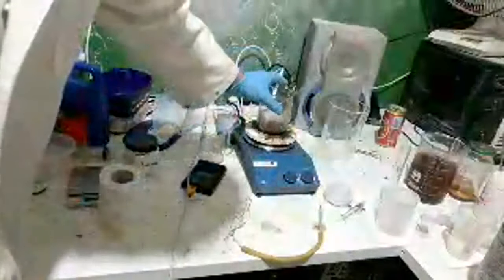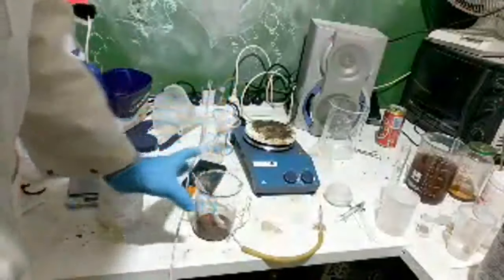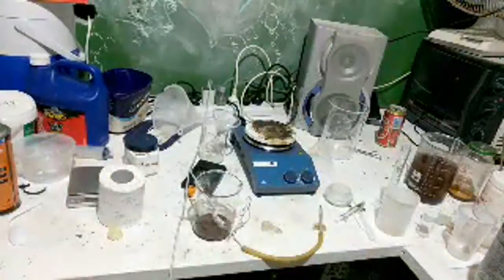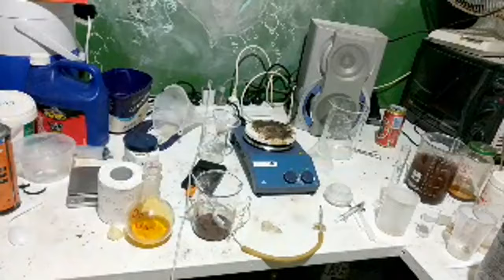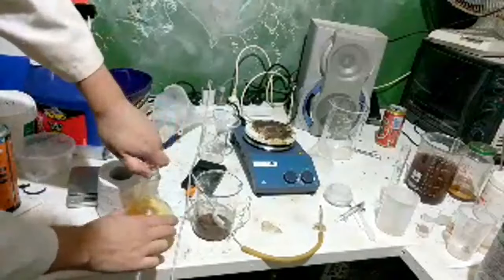Should it be dissolving better than that? I'll give it a bit of heat. Don't crack it, it'll crack the glass. Should dissolve, right? It should be good, concentrated nitric. Bring out the big guns. Don't have time for this. Red fuming, let's do it. Take off the nitrile gloves, that's always important. Glasses on. Oh, that's pressurized.